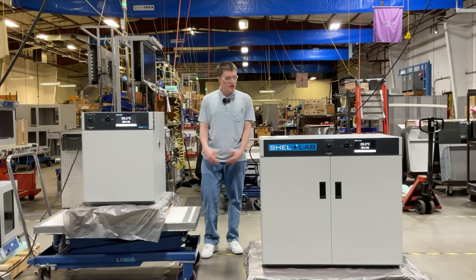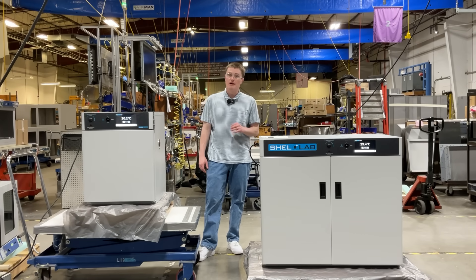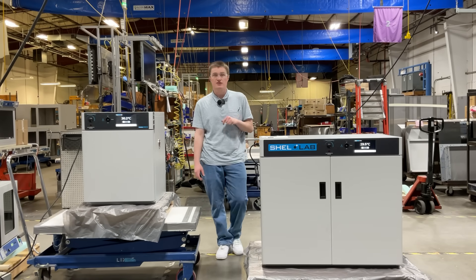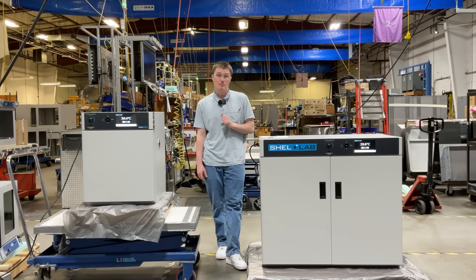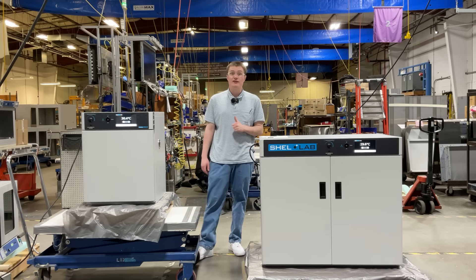For researchers looking for high performance, reliable, and user-friendly incubators, the Shell Lab SMI microbiological incubators are the perfect choice. Upgrade your lab today!